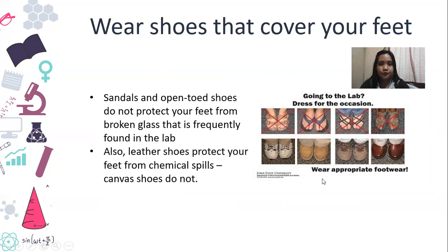Sandals and open-toed shoes do not protect your feet from broken glass that is frequently found in the lab. Also, leather shoes are very good because they protect your feet from chemical spills. Fabric or canvas shoes, like rubber shoes, do not. The chemicals might seep through or sometimes even burn it because it's fabric. So we usually wouldn't allow you to wear rubber shoes as well.